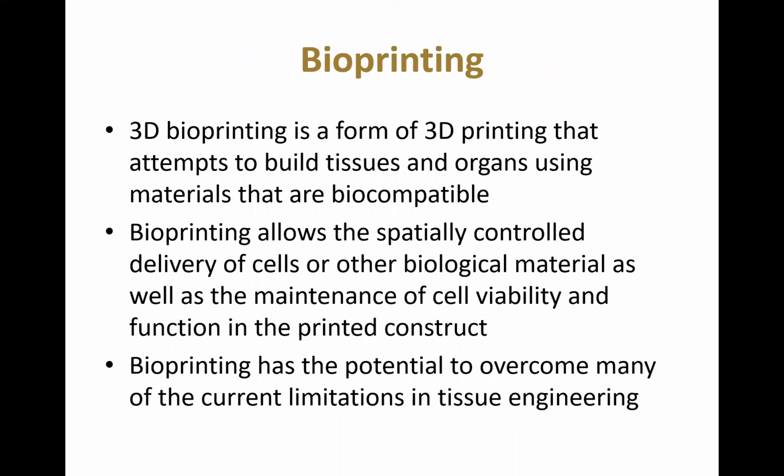Now, moving on to bioprinting. 3D bioprinting is really a form of 3D printing, but it adds another layer of complexity because we attempt to build tissues and organs that use cells and biocompatible materials. 3D bioprinting allows the individual to really control the delivery of cells in a spatial orientation, as well as add other biological materials such as growth factors within the printed construct.